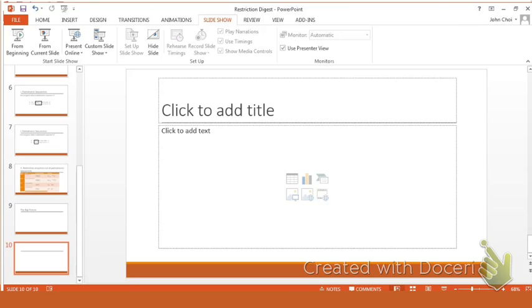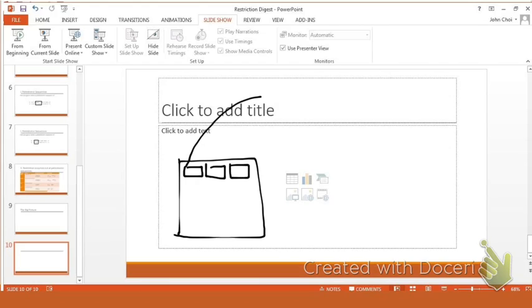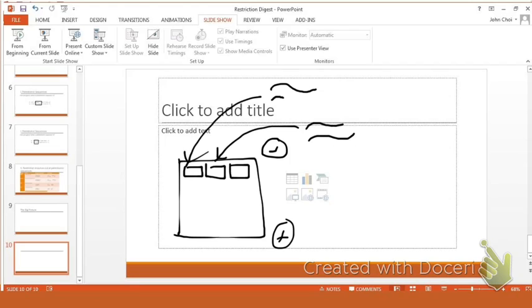We can load the different sized fragments into these wells. So let's say we put Amar's big piece and small piece here, and we put Wells' medium piece and slightly bigger medium piece in here. If we run a current through it, from the negative charge to the positive charge, do you guys remember from Tuesday what charge DNA is?